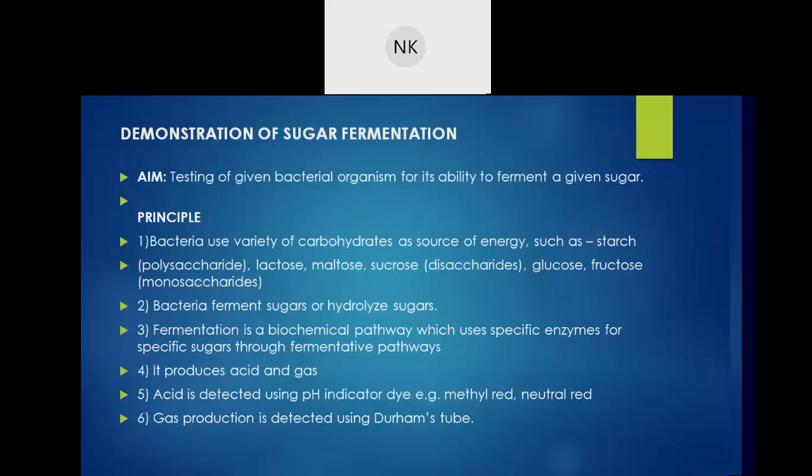Now here in this demonstration of sugar fermentation, the aim of the experiment is to test a given bacterial organism for its ability to ferment a given sugar. Whether or not a particular bacteria is able to ferment or metabolize that sugar, if it is able to ferment the carbohydrate, it should produce certain end products.